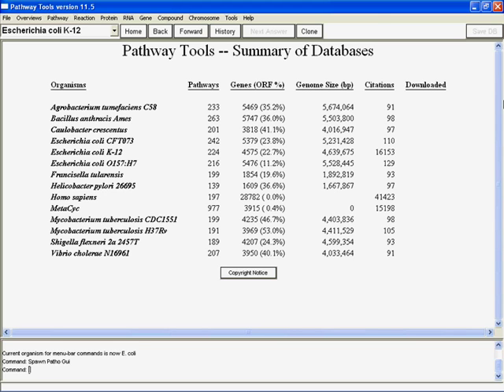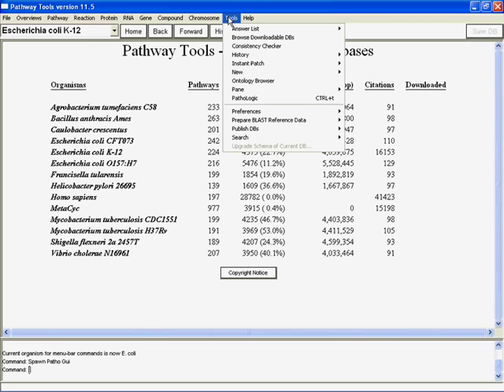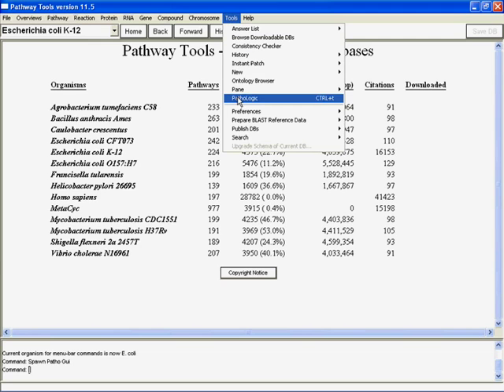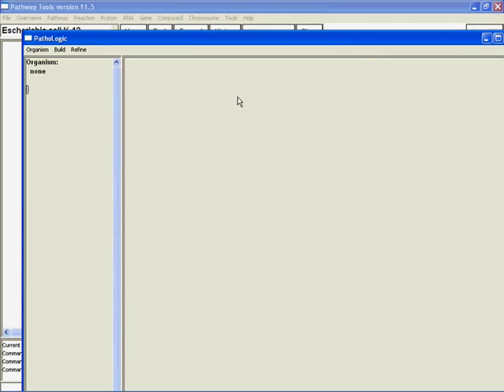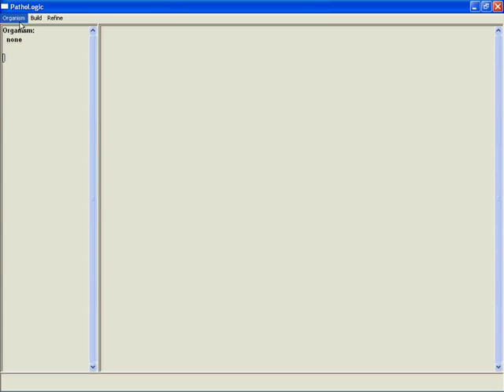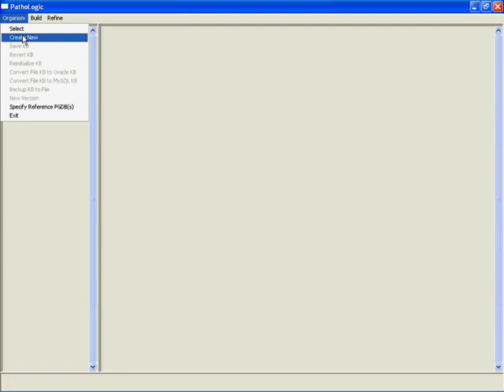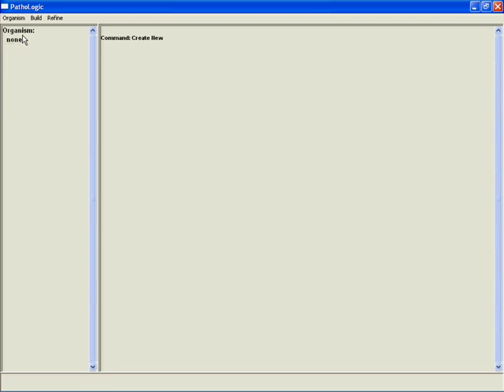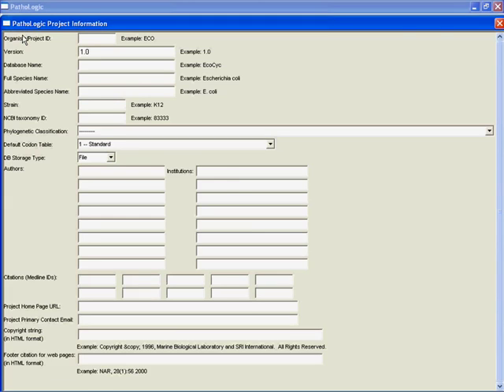So to get started making our own database, let's go to Tools and click on Pathologic. And that pulls up this Pathologic window that tells us that we don't have an organism selected and that there's nothing going on. With that in mind, let's go over to Organism, Create New. And we get this window.